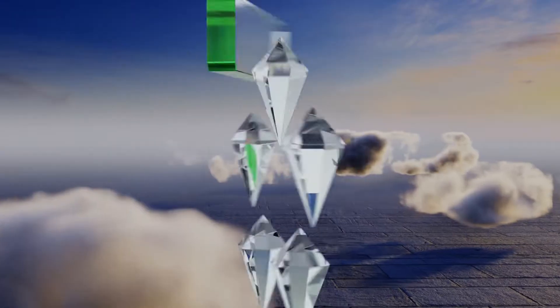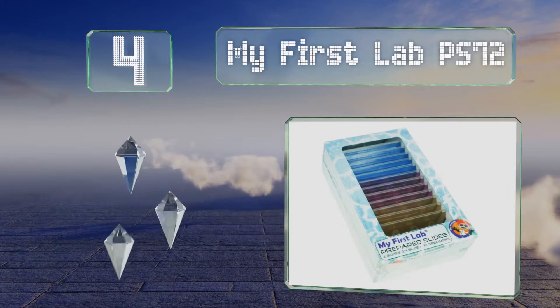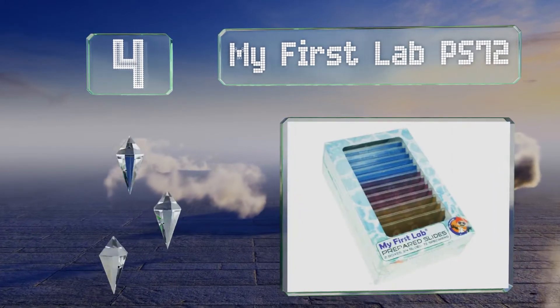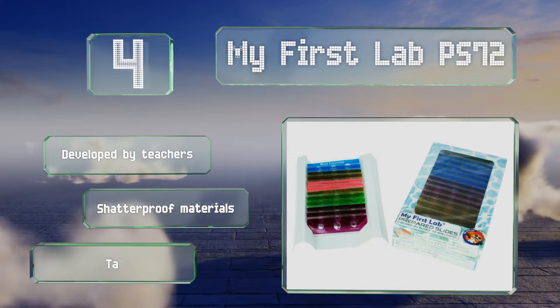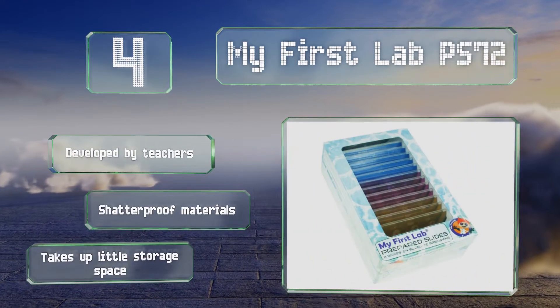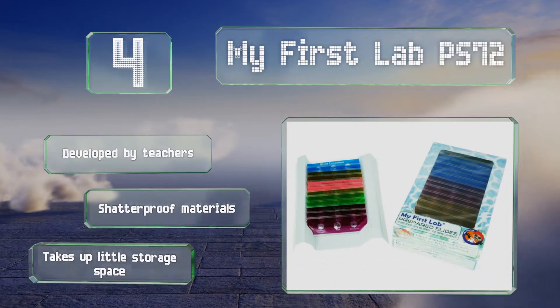At number four, the award-winning My First Lab PS72 consists of 24 colorful slides with three professionally mounted specimens on each. You get a wide range of items to examine such as salt, sawdust, pollen, hair, and mosquito larvae. This one was developed by teachers and is made with shatterproof materials. It takes up little storage space.